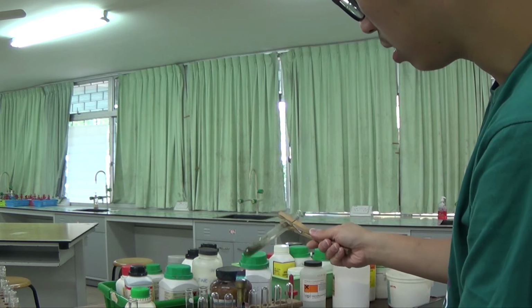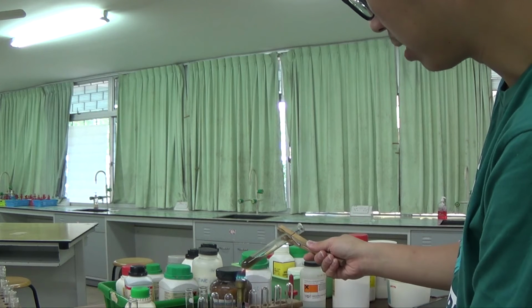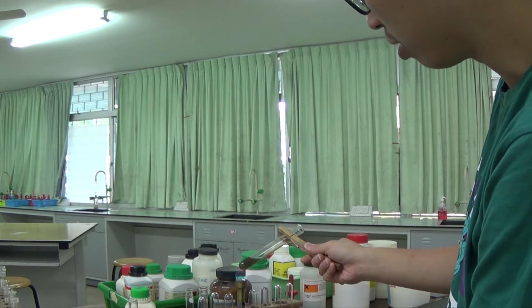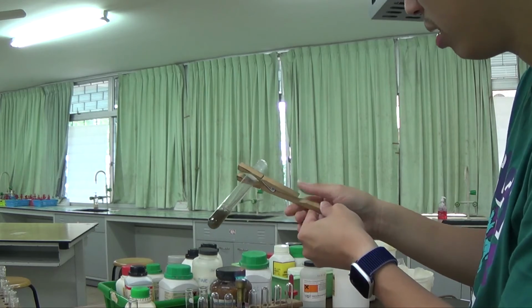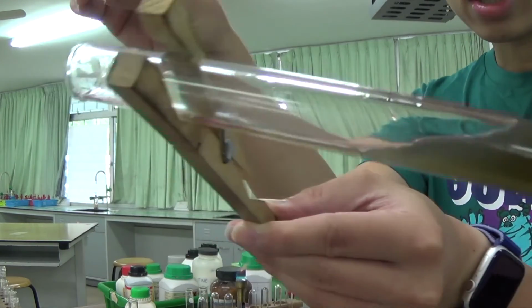You heat it until it doesn't exactly boil, but it reaches the kind of boiling point, because Bunsen burner heat is actually very intense when it's on blue flame, not when it's on yellow flame. So you never heat with the yellow flame. It's starting to boil already. I get a bit of gas given out already. Okay, the gas is given out.